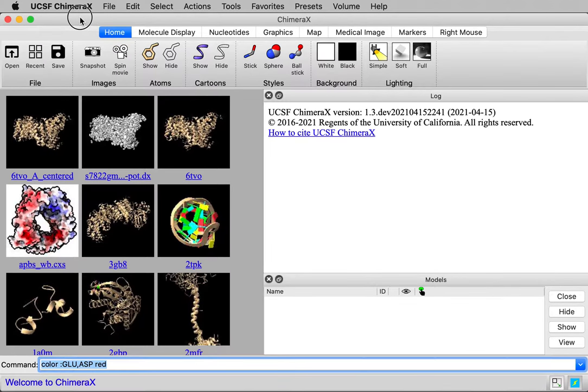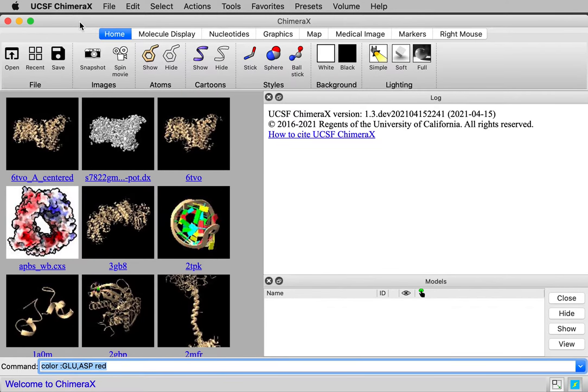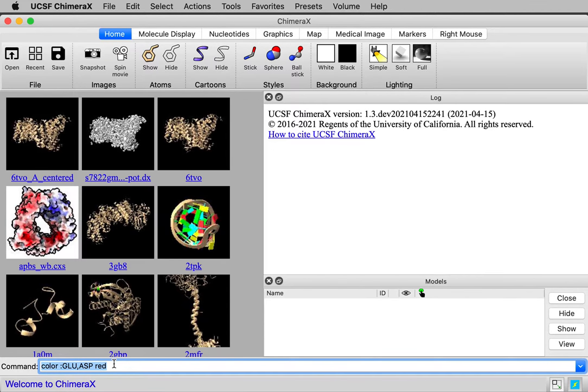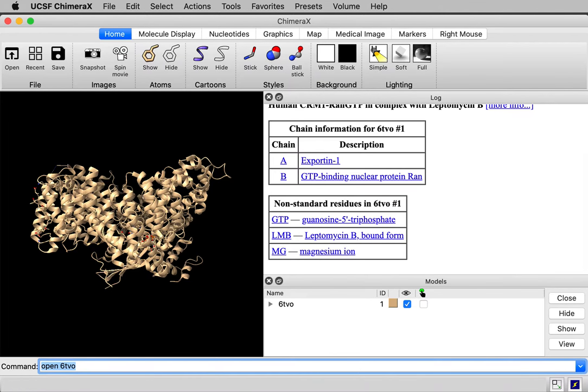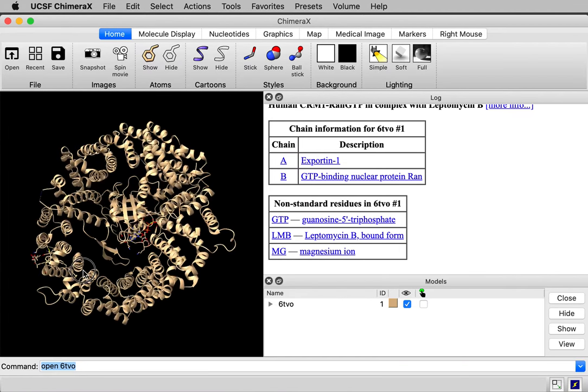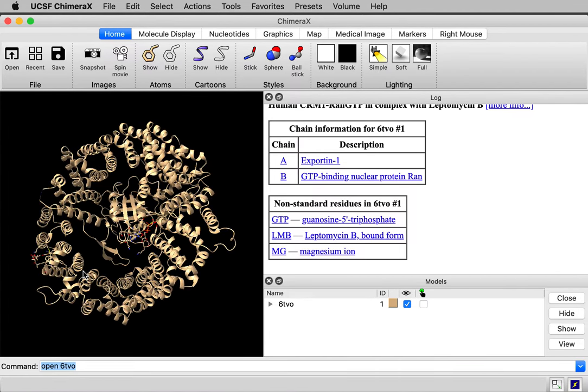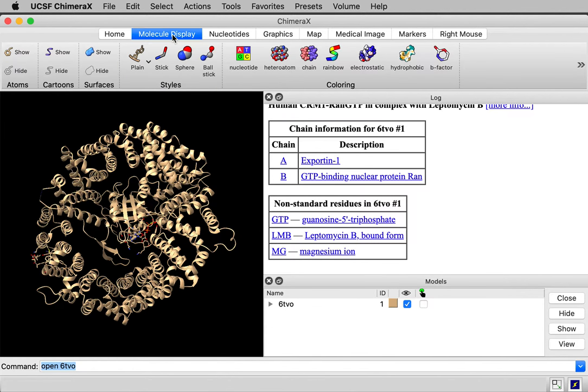The protein we're going to look at is called CRM1, it's a nuclear export factor. Its PDB code is 6TVO, so I'll say open 6TVO. I'm going to show a molecular surface. I'll go up to the toolbar under molecule display, show surface.